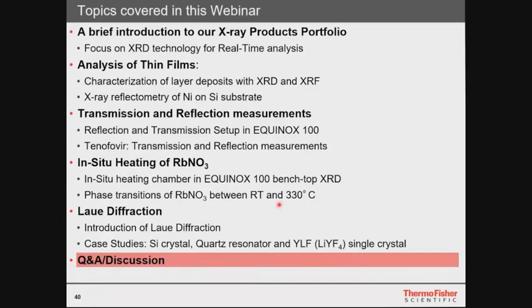You can also use monochromators or mirrors. Monochromators use diffraction, because the diffraction angle of each energy is different. So you can, for example, separate K-alpha 1, K-alpha 2 and K-beta by using a germanium monochromator, and you can even focus the radiation to get more intensity. Then you get very brilliant radiation, which only consists of one energy and only one set of signals. But you sacrifice some intensity.